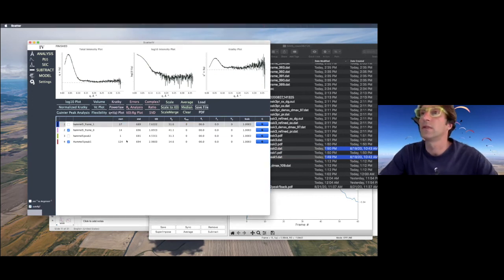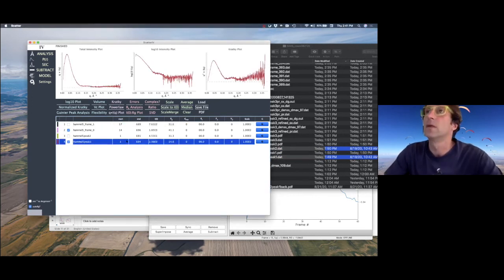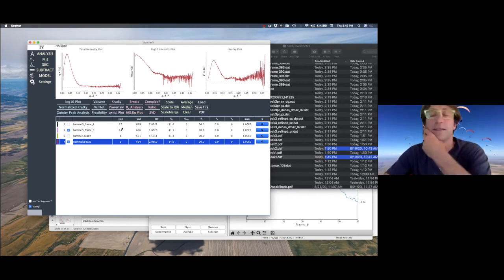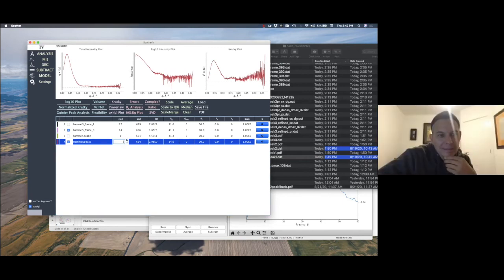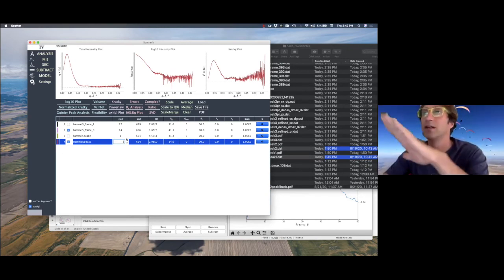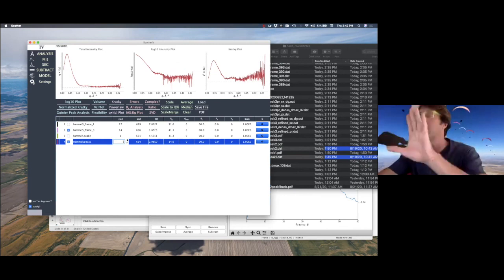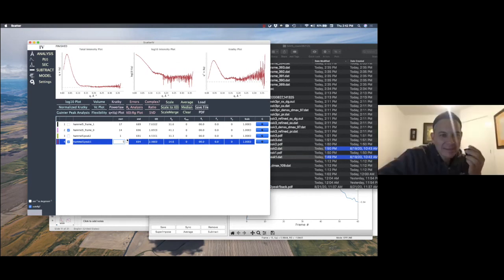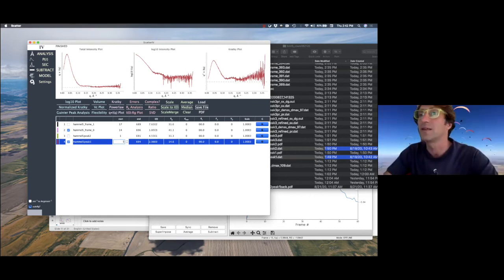Okay, so this is another problem with the scatter. What happened? Now it's automatically selecting and deleting the points when it thinks it's aggregated. Just forget that, but that's the auto Rg. It doesn't allow you to take those data anymore. You say yes, I need those, and it says no, and the code is going back and forth, auto Rg versus you. You could turn off auto Rg. Yeah, well, I need to do that, but sometimes. Happy?